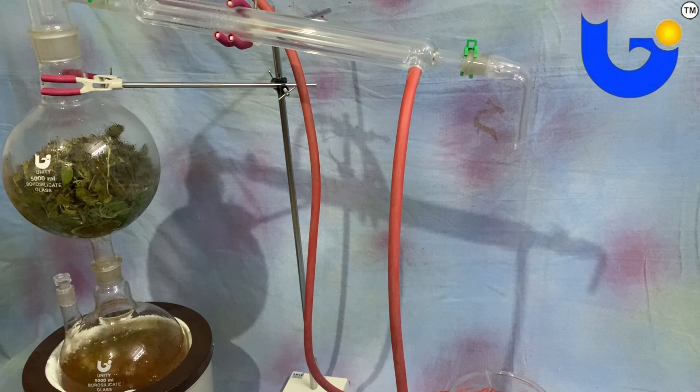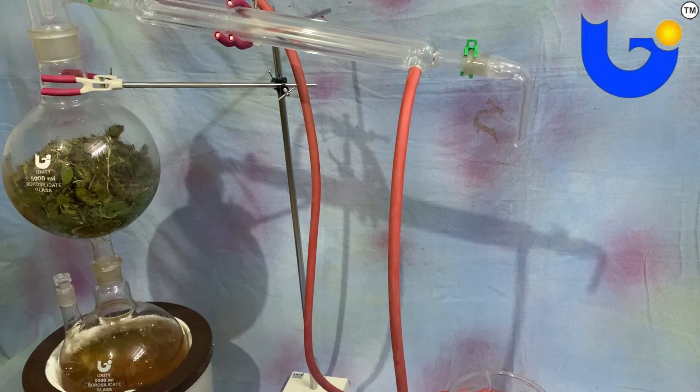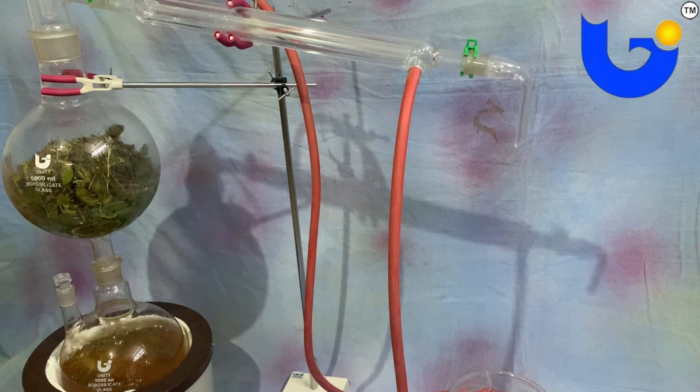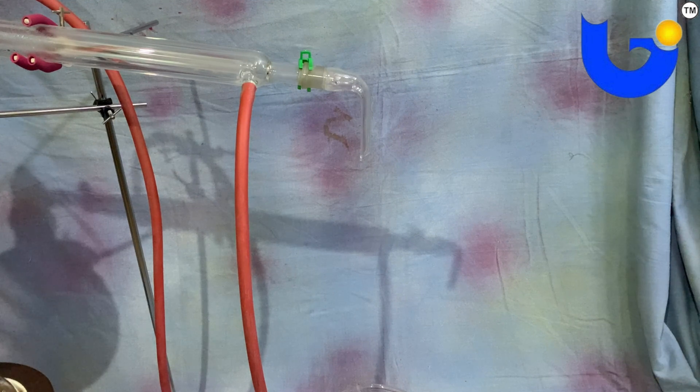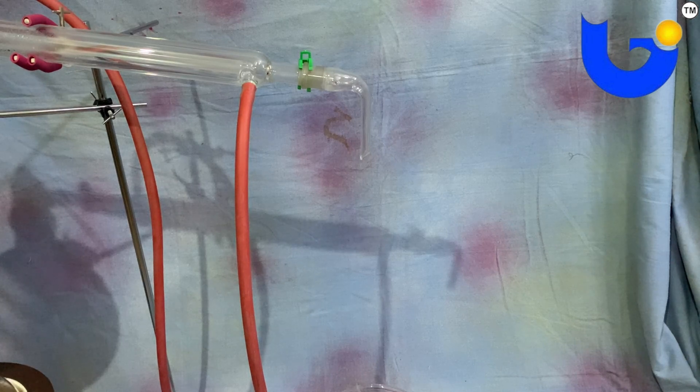Whole unit is constructed using high quality borosilicate glass. Borosilicate glass is special type of glass which is heat resistant and used in pharmaceutical companies for making medicines. The borosilicate glass is non-reactive and highly transparent which helps the reaction to be completely isolated and the output is natural and completely chemical free.